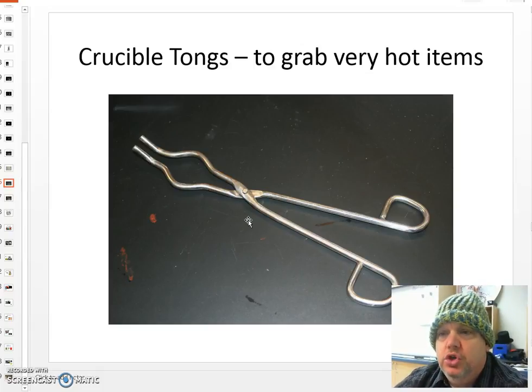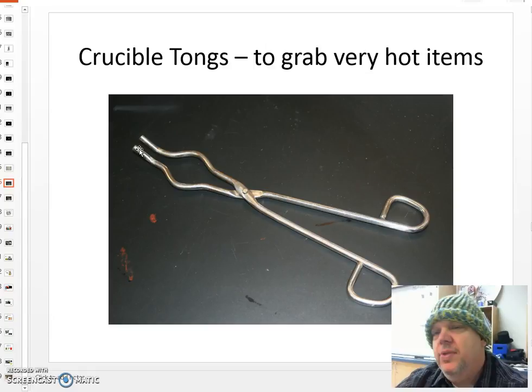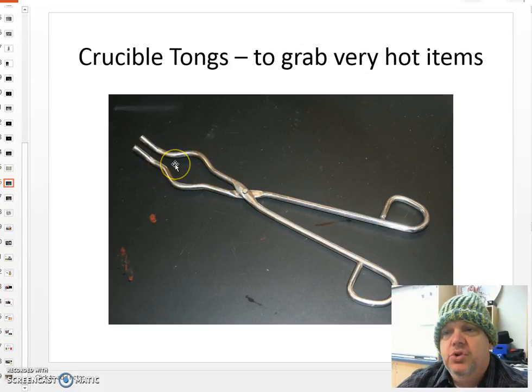You may notice that there's two main parts in the crucible tongs. One part, you have the end here where the parts are parallel to each other, and that's great if you want to grab a crucible or an evaporating dish by the wall. Now, what if you were grabbing something wider than that? What if it's a round object like a beaker, or maybe the neck of an Erlenmeyer flask? That is where you have the circular part of your crucible tongs that will allow you to do that. Again, it's a convenient safety device. Crucible tongs do come in different sizes. The size that you're seeing there is a standard size for what we have.